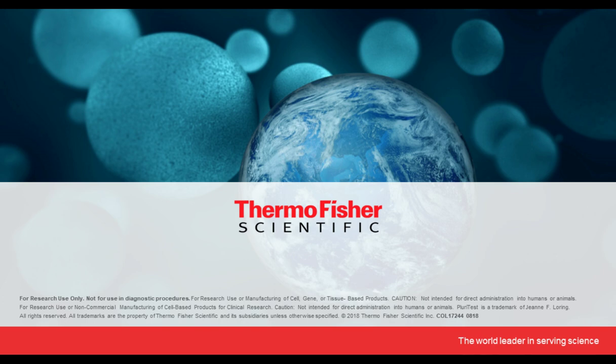I also get some researchers who are interested in genetically manipulating, doing gene editing of their PSC clones, and sometimes they want to just do one SNP deletion or addition. So it's also appropriate at that time, if you do that gene editing, to use the resolution that you need for how big or little your gene editing can be.